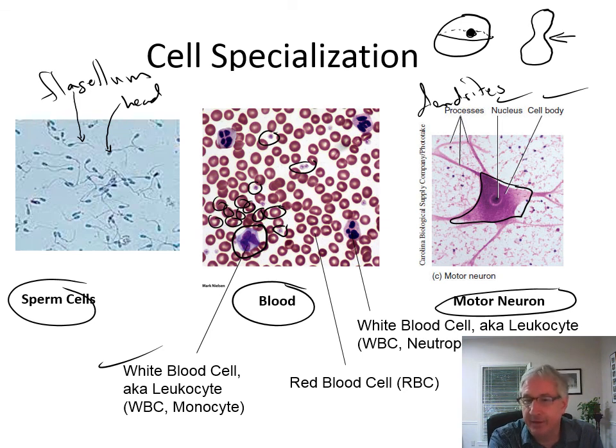It's hard to tell which it is, so let's say this one right here is the axon. Dendrites are what a nerve cell uses to reach out and touch all the other nerve cells around it and communicate with them. An axon is also used to communicate, but there's only one axon per nerve cell. We'll get to that later on. Don't worry about that now.